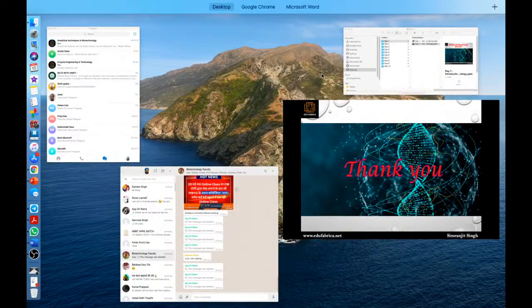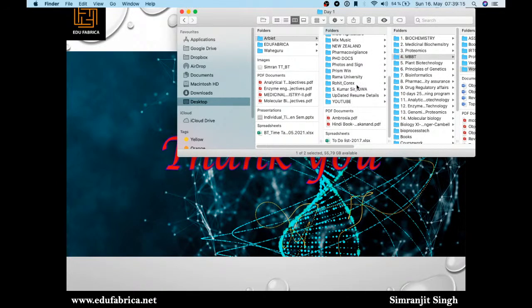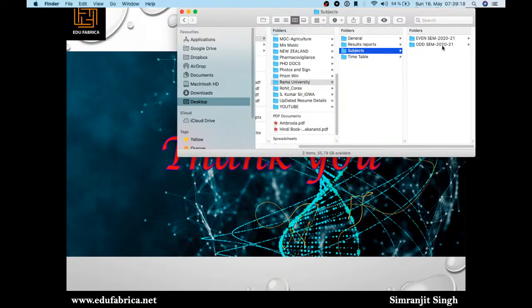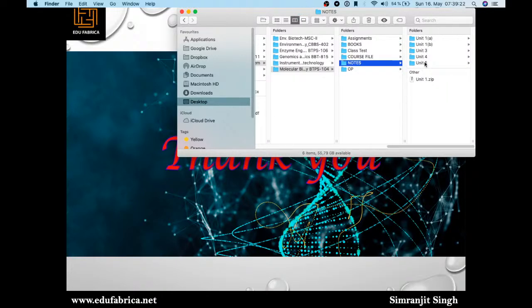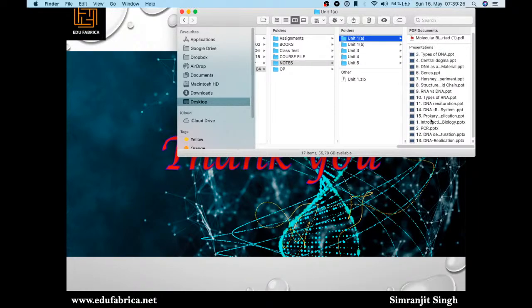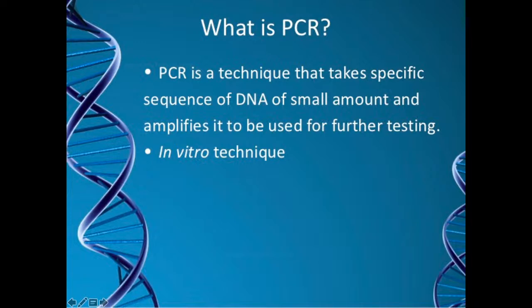Now I will take you to the PCR part. So what is PCR? Once you have isolated your DNA and you want a particular template to be grown properly, in that way we do the PCR. That is your polymerase chain reaction, which could be used for further testing.